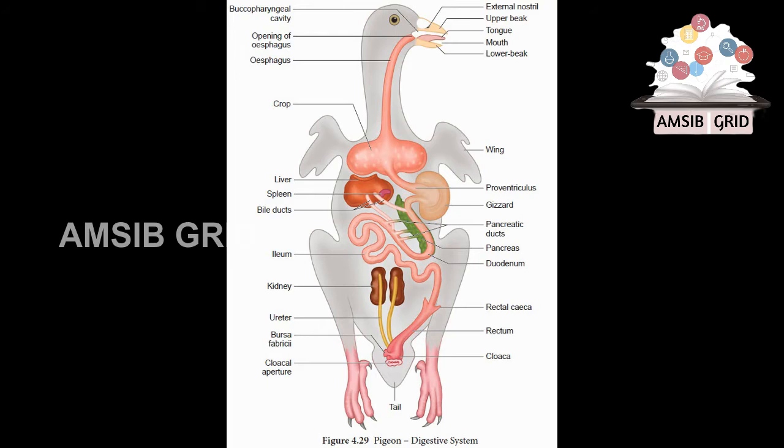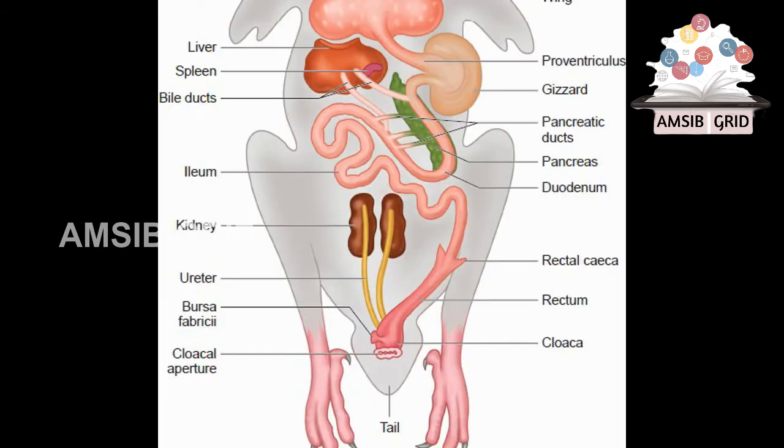Locate the intestine, which follows after the gizzard. Look for the large, lobed liver, which overhangs the intestine. If you separate the coils of the intestine, you should be able to see the pancreas. Look for the pancreatic ducts, which pass from the pancreas to the small intestine.